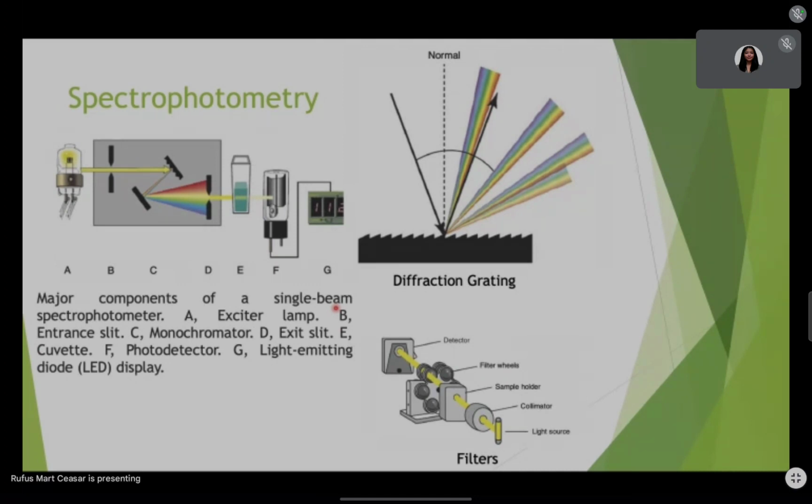So next ay after ng light source, meron tayong monochromator na tinatawag. A system for isolating the incident light for a desired wavelength na gusto natin. So, in-exclude natin yung ibang wavelength na ayaw natin. Kunwari, select natin, gusto natin 500 nanometers lang. Yun, pwede nating ma-select yun. So, ang ginagamit natin for spectral isolation usually includes filters.